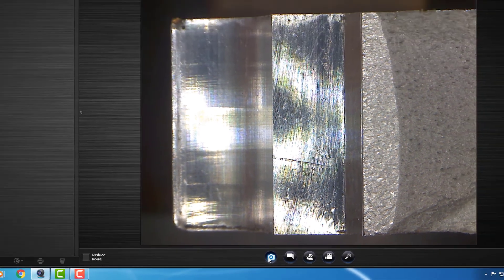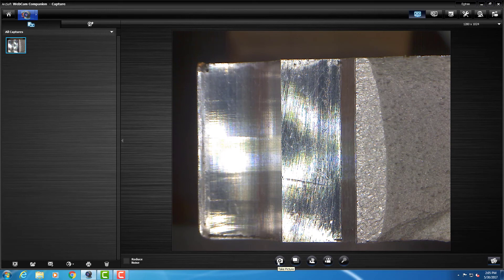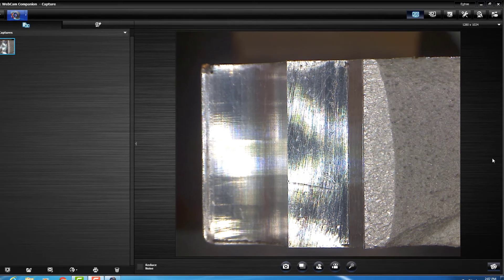Once content with the on-screen view, click the camera icon at the bottom to capture an image to file. When finished, close the program using the menu bar or exit icon.